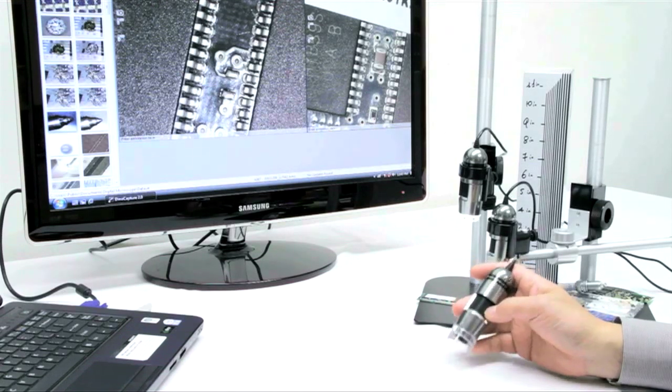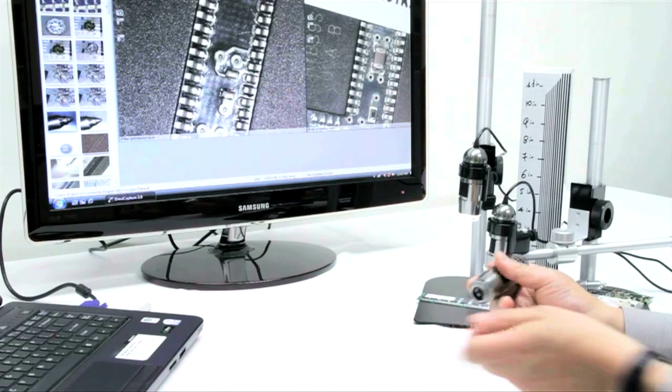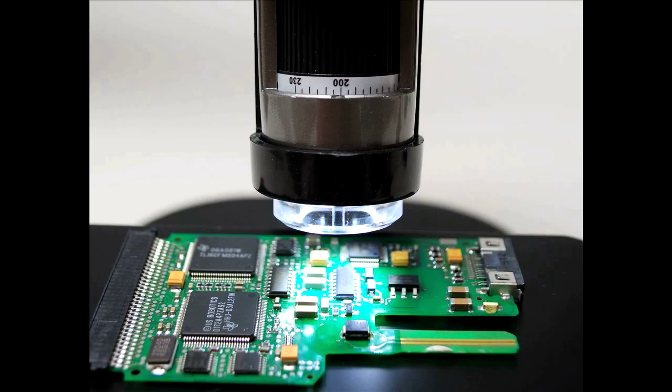And then we have our AD7013MT, which features 10 to 240 times magnification and does have a removable cap so you can get the highest magnification without touching the object.